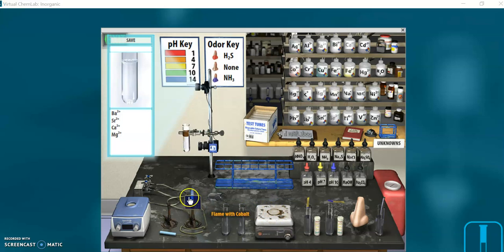Now, before we actually do chemical tests, we're going to do as the worksheet suggests. So I'm going to hit this divide button, which just divides it in half or actually makes a new test tube there with the same stuff that's in our test tube on the stand. And that's simply, in case we make a mistake, we've got an extra sample of the original to work with.